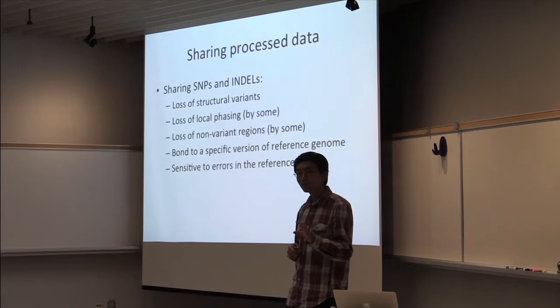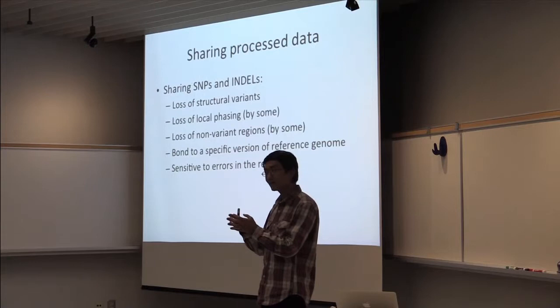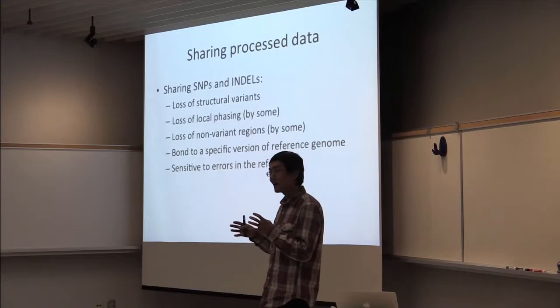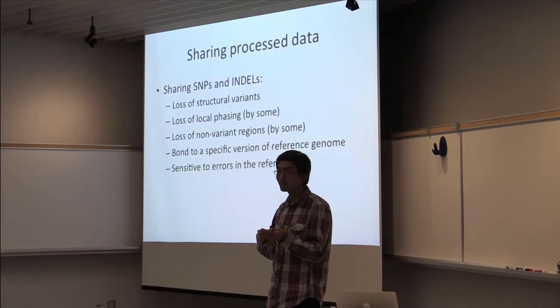If you read the papers, a lot of people are doing comparisons between call sets. And when they do the comparison of call sets, some people found the discrepancy between call sets can be as high as 20%. You take the same alignment and run two callers, and in some scenarios the difference is 20%. Will you trust it? Will you keep this data? It depends on how you compare it. If you compare more carefully, it's smaller, but still it's around the several percent to 10% range.